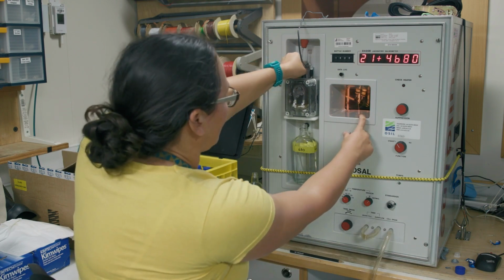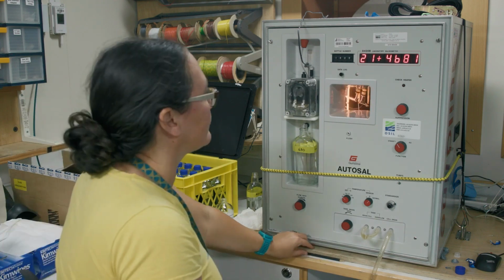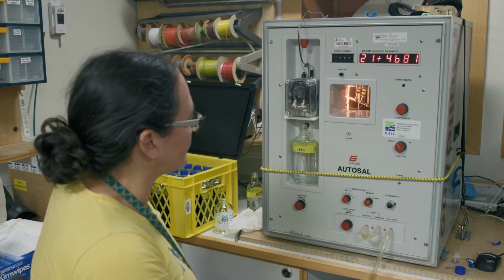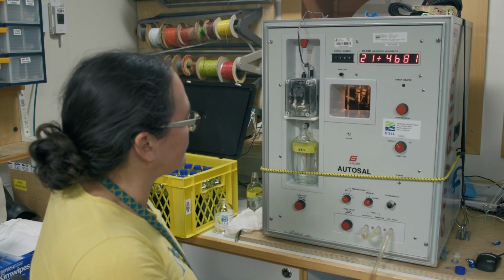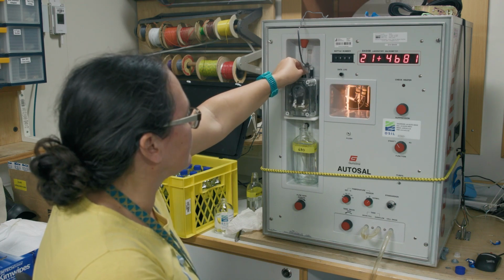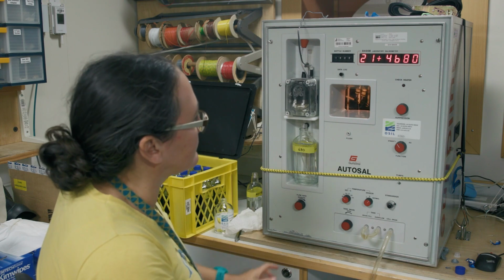Switch on the peristaltic pump, cover the flush valve to empty the cell, and allow the cell to fill completely with water from the sample bottle. Flush and fill again, and again. Turn the peristaltic pump off, allow the volume in the conductivity cell to equilibrate to the bath temperature, then switch to read.